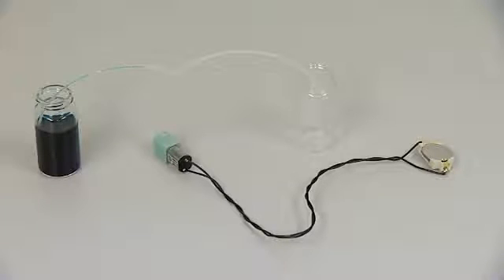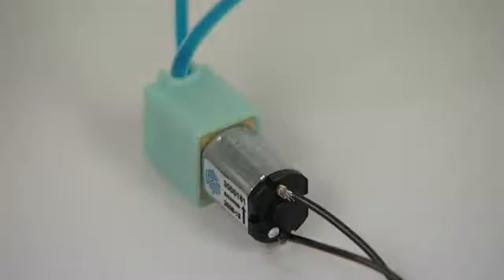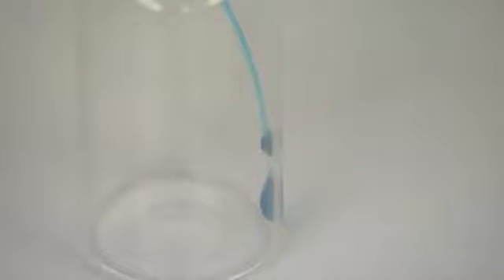Finally, our miniature peristaltic pump offers a low-cost compact solution which can work for many hours from a single battery.